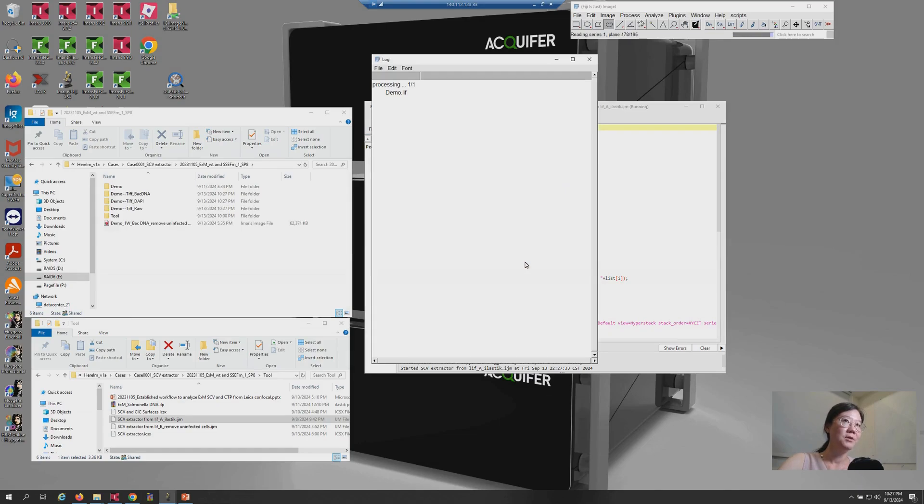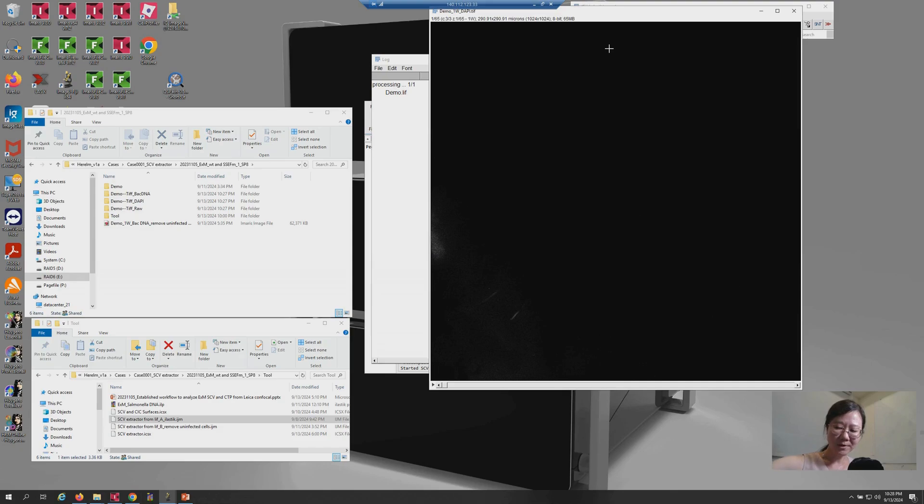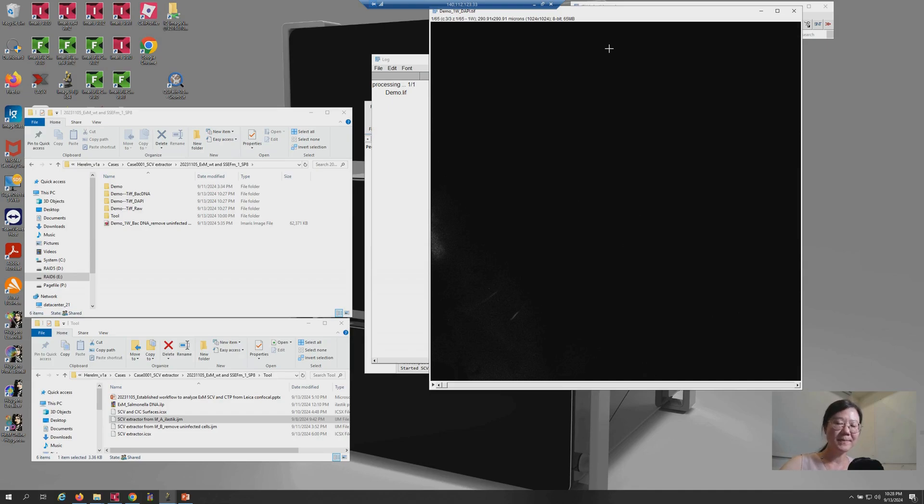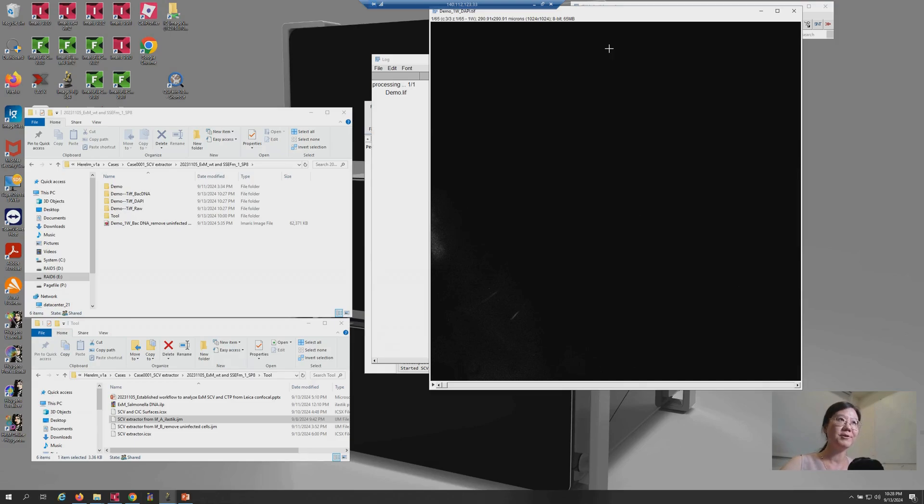Now the script is running. And it takes time waiting for the machine learning tools to extract the signals. From my experience, it takes about six minutes to process the datasets carrying 150 slices. So, now please go have a coffee for yourself and come back later.